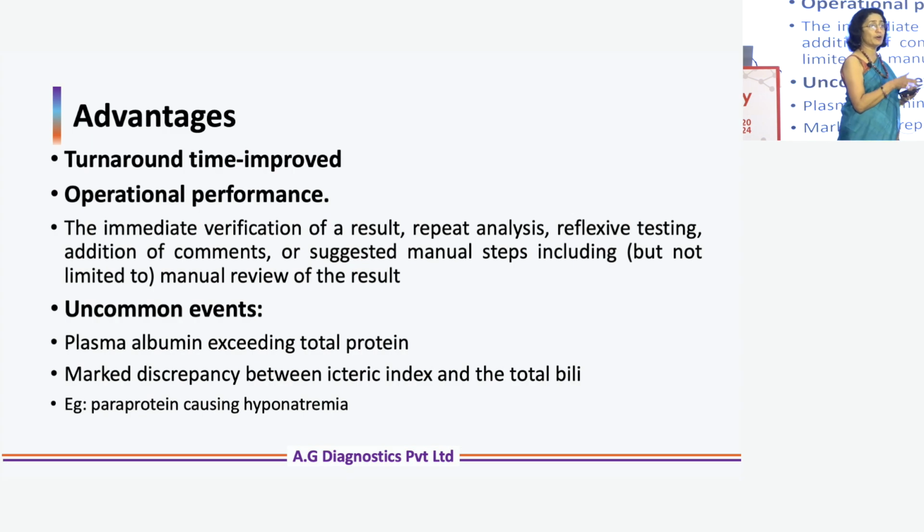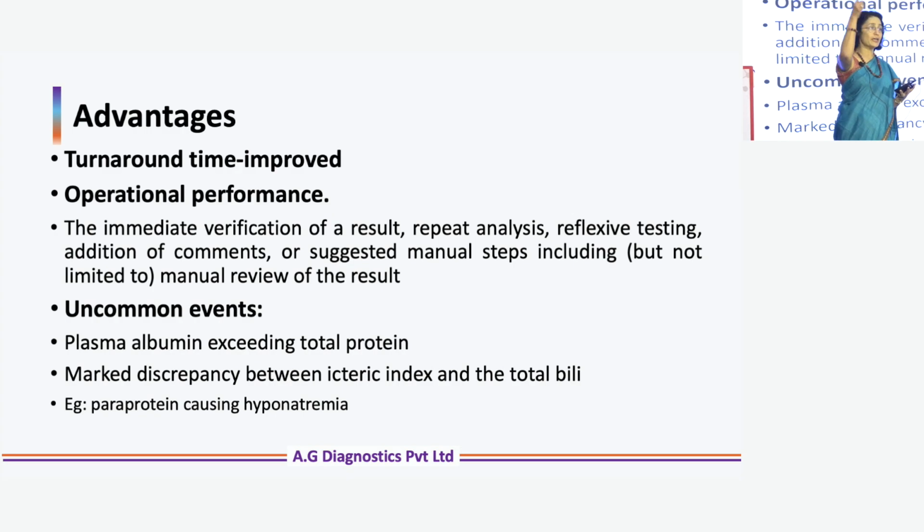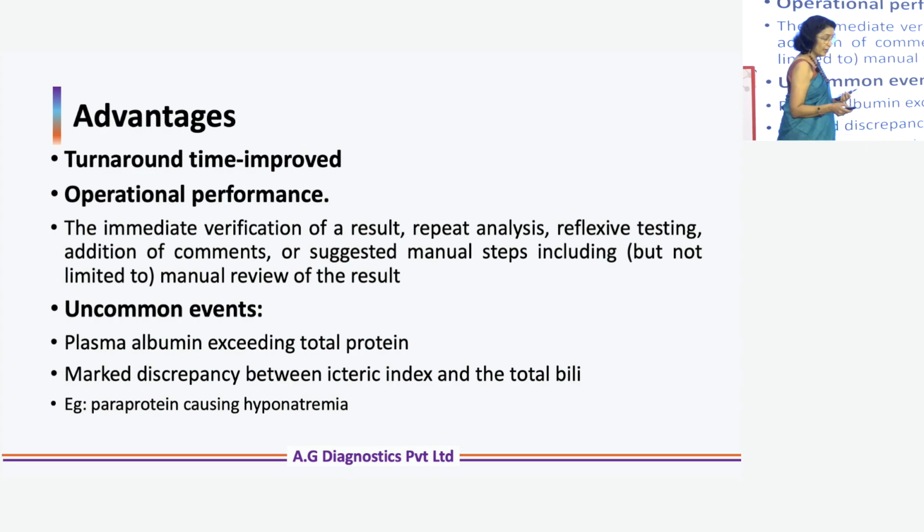Or see, if you have a good algorithm, it will even pick up the paraprotein which you have reported 1 month ago when you are giving out the sodium today, because you have put in the delta check also in place. Which in fact a pathologist may not remember, or if it's a large lab, you may not access that data, but an auto verification engine will very diligently and automatically go back to the previous data.